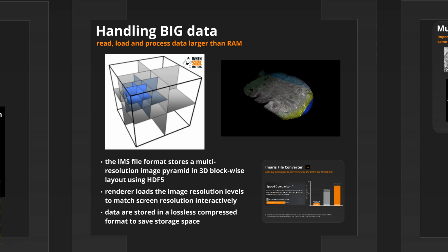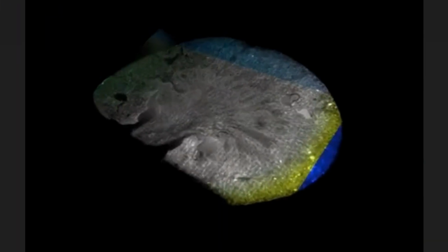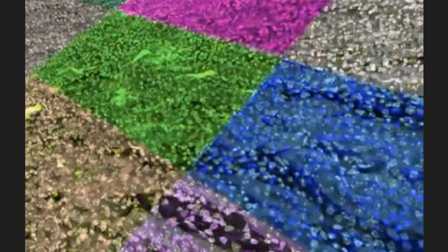It's a kidney section, I believe. So I'm going to zoom up and let you take a look at this. Now, the colored blocks on here are indicating different resolution levels. As you zoom into that kidney, you'll see more and more blocks, and more blocks indicate that we're looking at a higher resolution. As you zoom out, you're starting to see less of the details, so the blocks get bigger. We're using a lower resolution visualization or rendering.